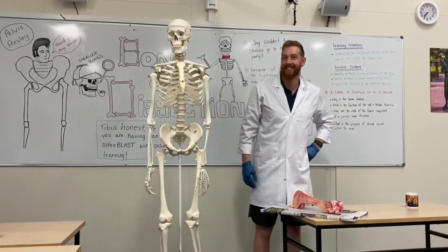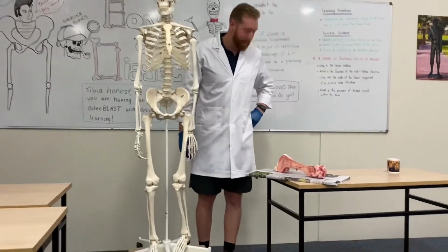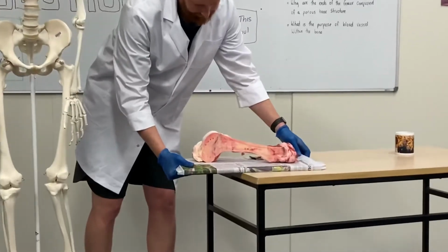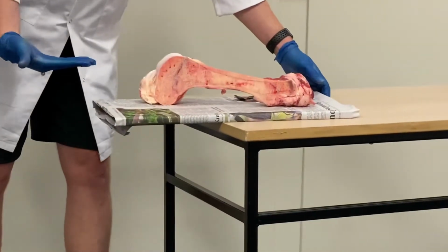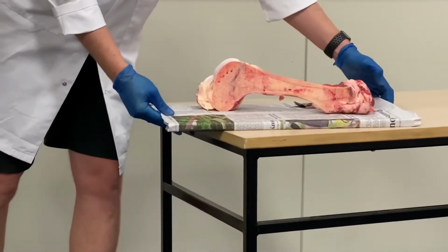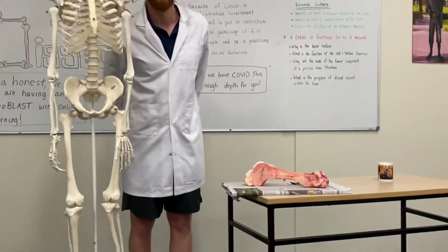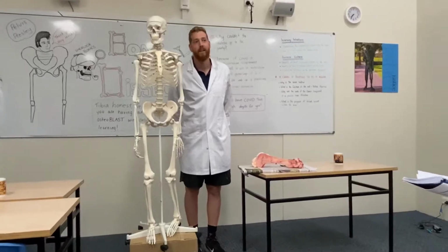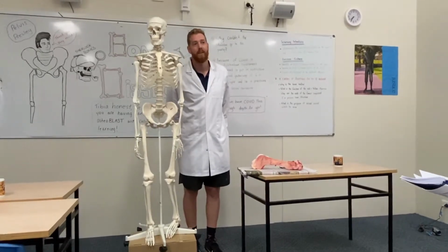Next, mineral storage sites. And Mr. Cook is just going to highlight our bone today. Our bone from a cow, which is a femur, and which has been cut in half, and this will have the mineral storage sites. We'll look at this more closely, and also critically it is involved in the production of blood cells. So that's a key part of bone today, which we'll focus on.